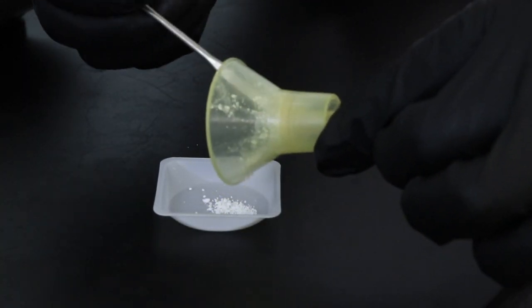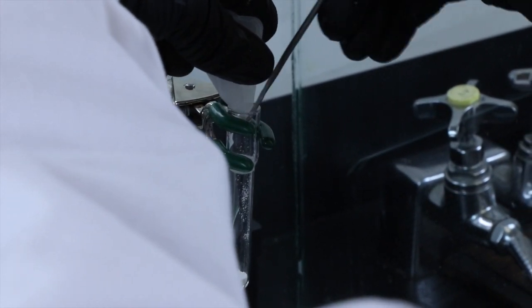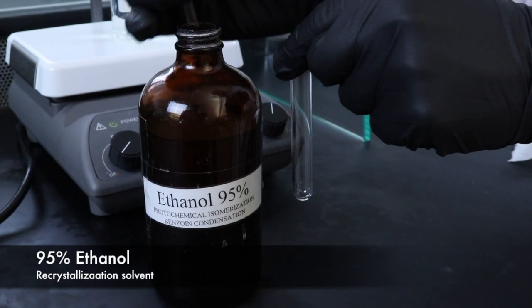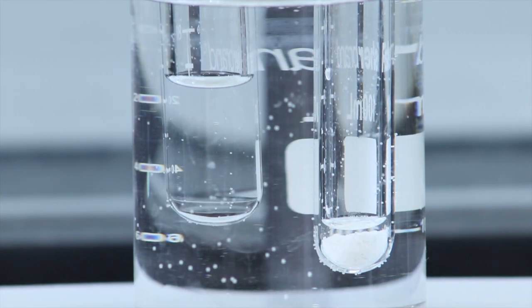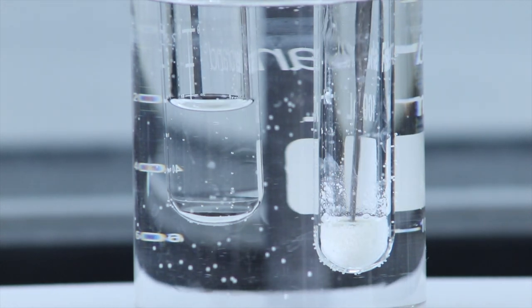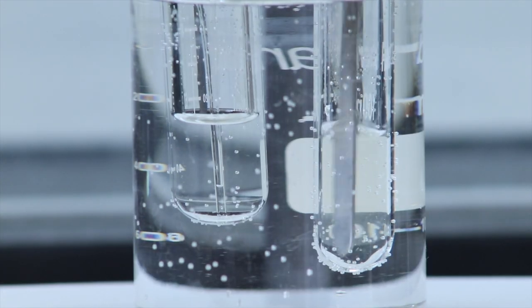I'll remove the crude product from the Hirsch funnel and follow the exact same process for recrystallizing this product as I did with the alcohol product, only this time I'll be using ethanol as the recrystallization solvent instead of ligroin. So, like before, I'll be adding just enough ethanol to dissolve the crude product at high temperatures, which is looking pretty good right now.